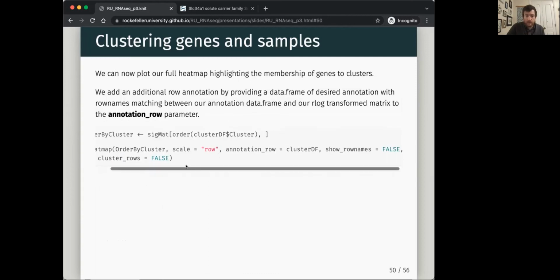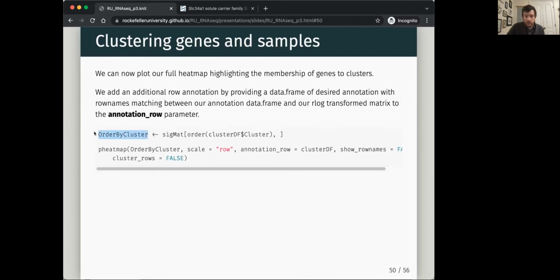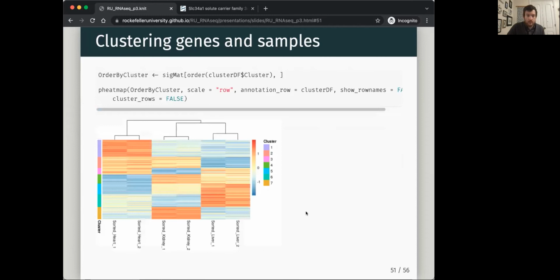And then when you do this, the reordered matrix goes in, and you can have a look at the matrix then, or the heat map. And so you can see it's now separated nicely, and you can see the patterns across and get kind of a more global vision of what's happening with this clustering.